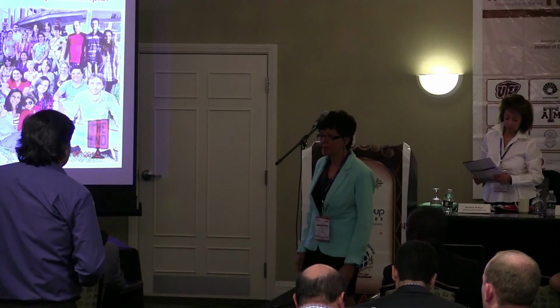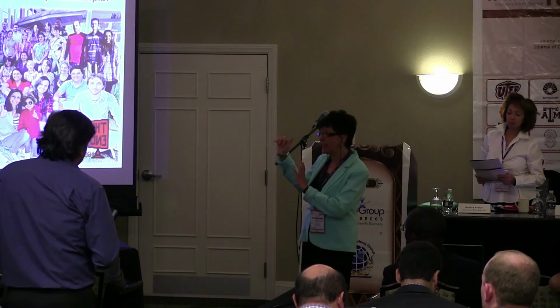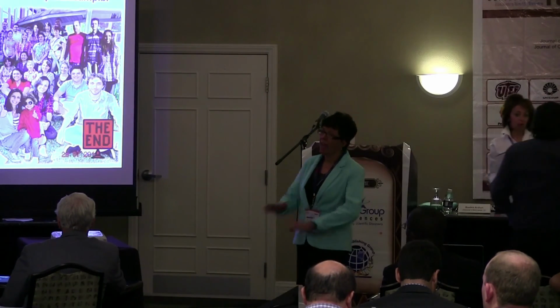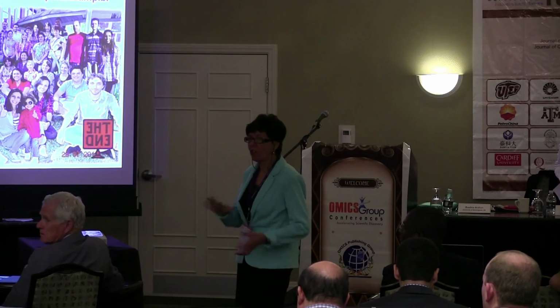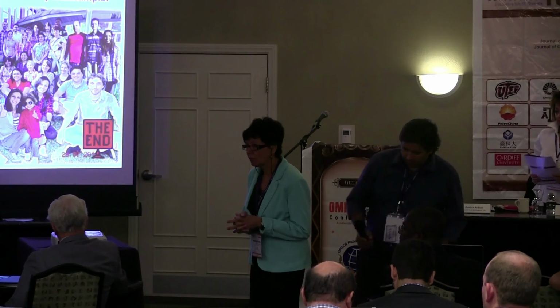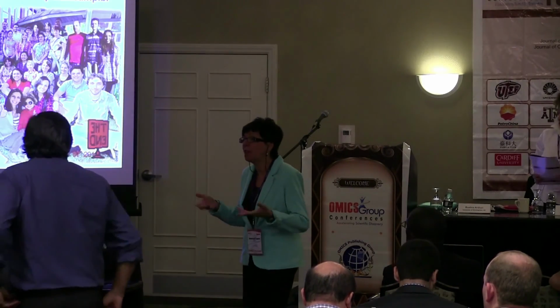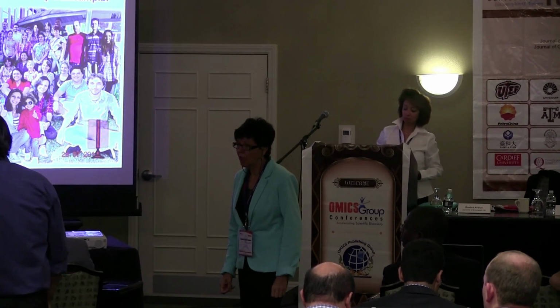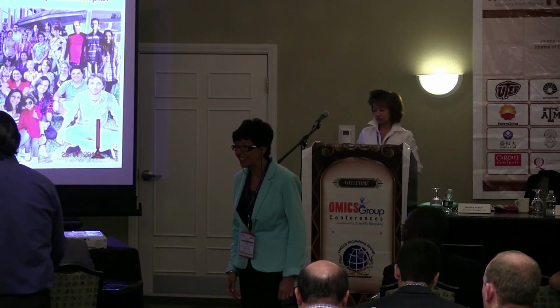Okay? That shows a picture that they presented at ASMS. It's very expensive, but somebody said you can just do MS using any surface. You can do the MS directly, right? Yes, it's in the profile, for example. Yeah, it could become very cheap with the technique. Of course, we have this proposal in the future.